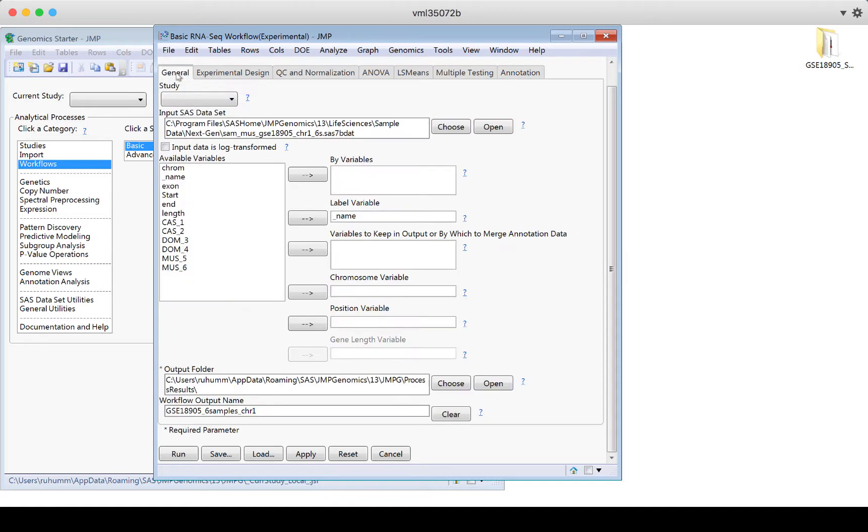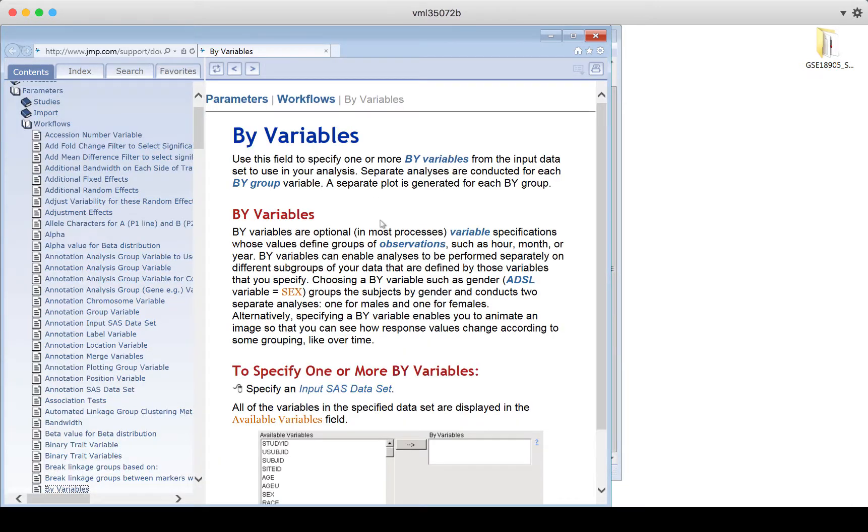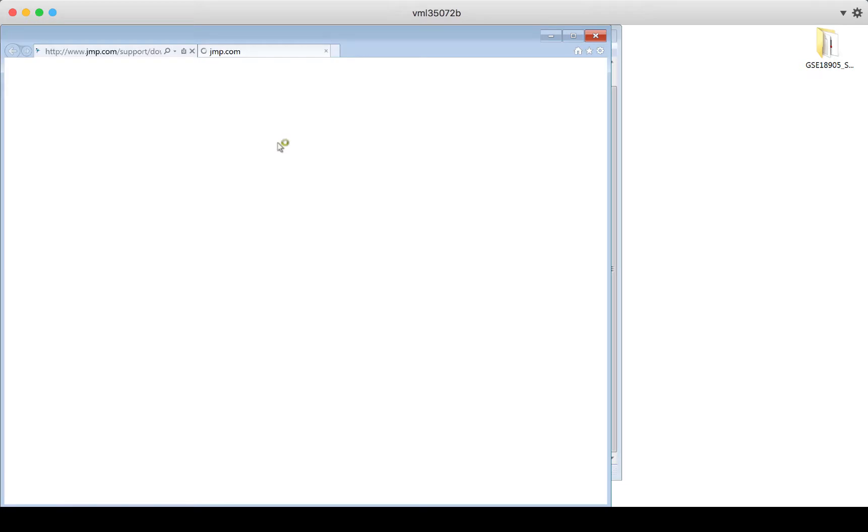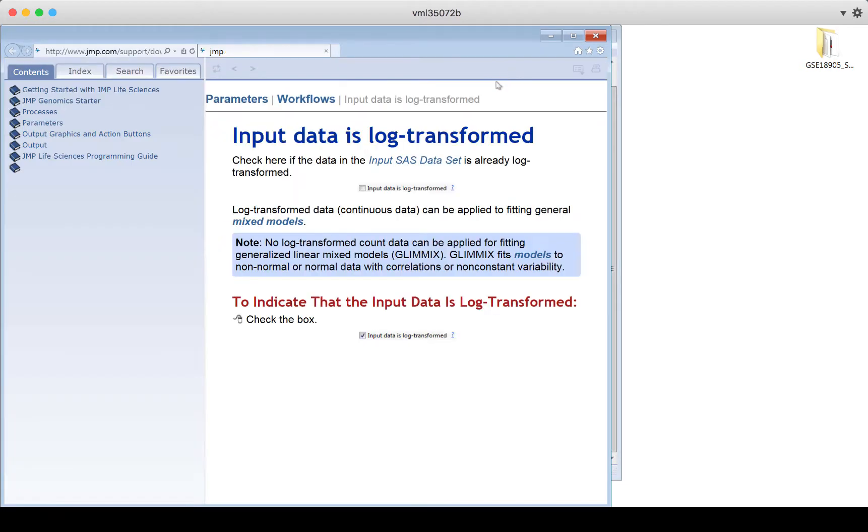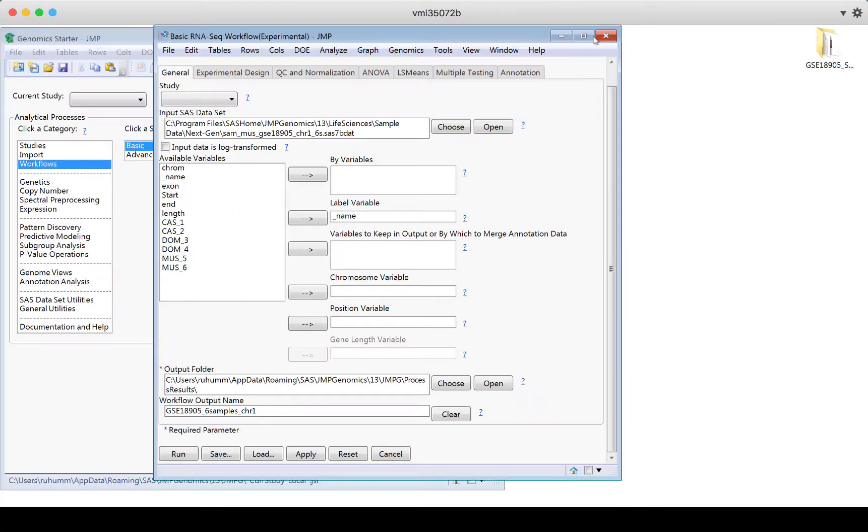So in this case, I start in general, and I see what variables are available, I can make selections if I want to. If I want to know more about what does by variables mean, I can click on this question mark right next to by variables. This takes me into the support, the help documentation, and it tells me about what the by variables are for. So it's really easy to find help by clicking on the question marks that appear next to each thing that you can do in jump. If I want to know what is this checkbox for input data is log transformed, I can click on that question mark. It's going to take me directly to that part of the help menu.